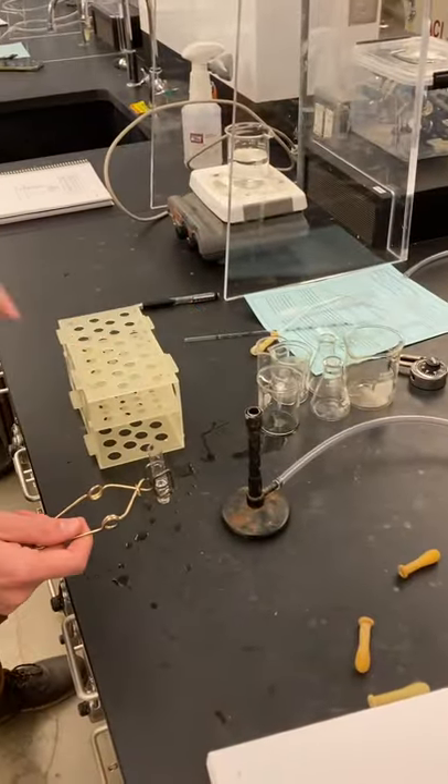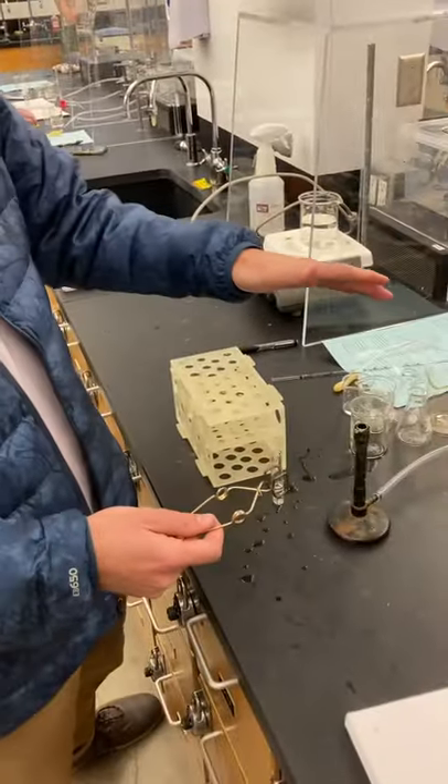Alrighty, so we have our Bunsen burner. As you can see, it's not on fire since this is a demonstration only. We're not going to light ourselves on fire. So imagine there's a flame there.